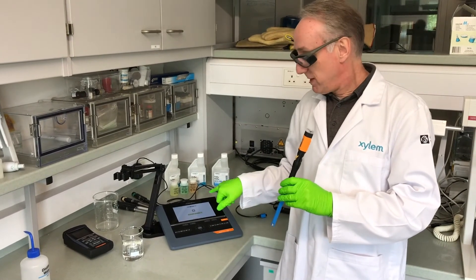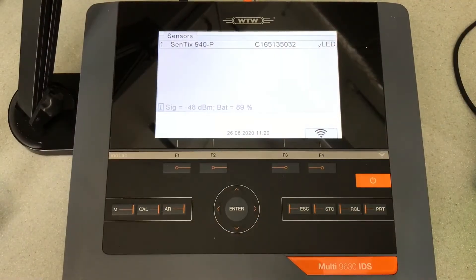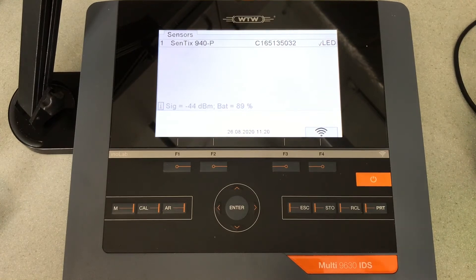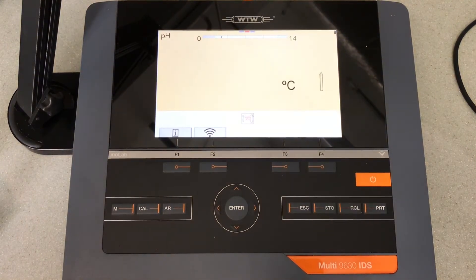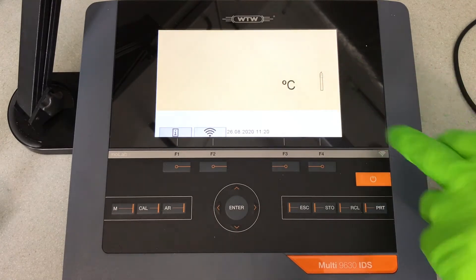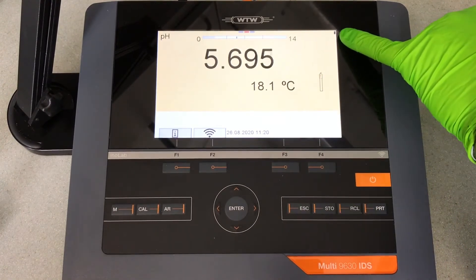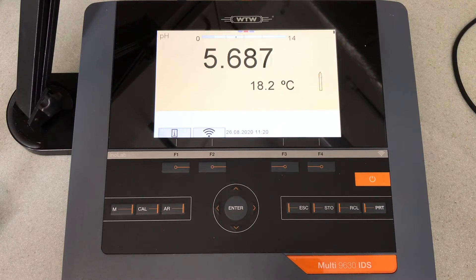The meter is now connecting to the probe — the probe has found the meter and we're ready to connect. So the meter is now connected to the probe in the same way that you're pairing your mobile phone to a car. Once it's done that, we just need to press the escape button here to then see what the pH reading is — it takes a few moments to make the connection. Again, you can see the icon showing the health of the probe and you have the pH measurement. In the top right-hand corner there's a very small icon showing the lifespan of the battery on the transmitter — it's pretty much full. Normally for pH, conductivity, and DO, the transmitter will give you around eight hours of working power.